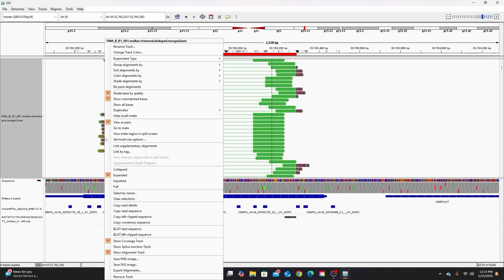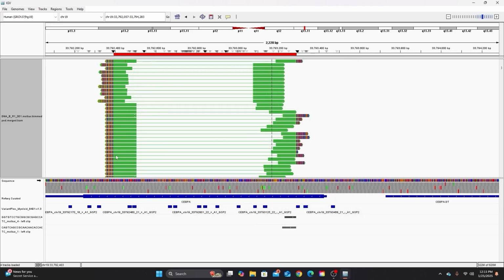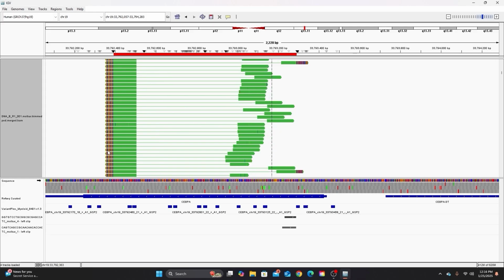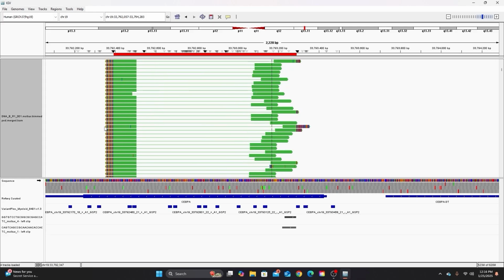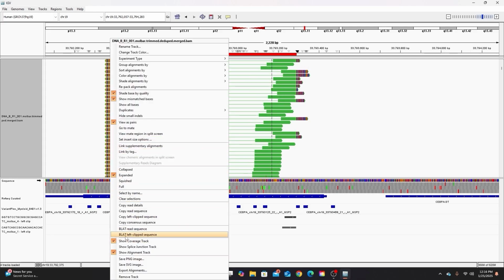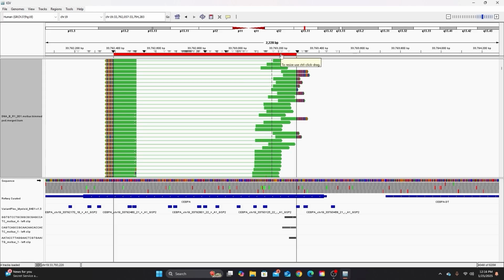All right, so let's do a few more just to build support. All right, there we go again. Same place. And so if I were to scroll down, you can scroll down to see if you see anything unique, but all of this pretty much looks the same. So I'd expect it to all align to the same place. I'm going to take a smaller one. All right, there we go. So we can just assume now, I think, that all of these belong over here, just inside that breakpoint.